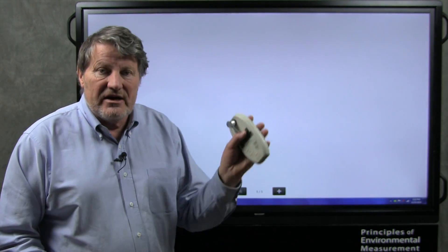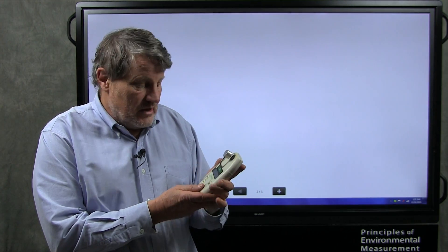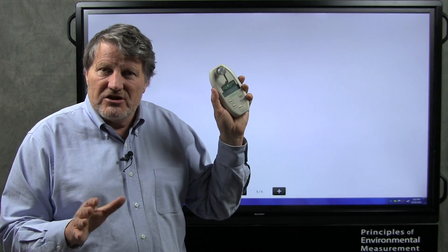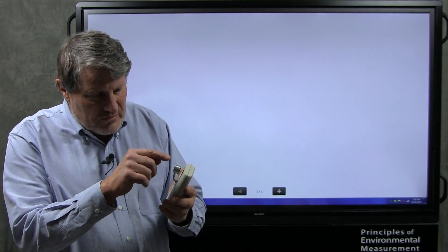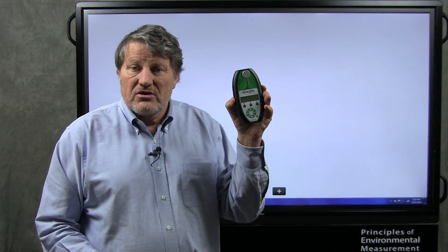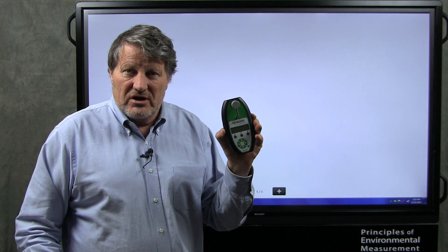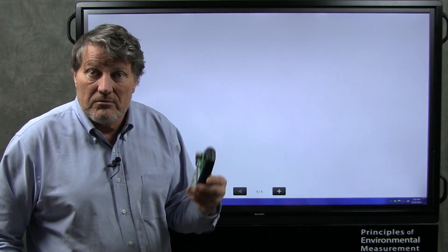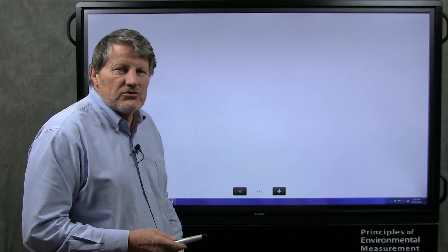Then some years later, OptiSciences came out with this meter. It has some advantages over the Minolta meter, little bigger area to average leaves, and then recently Apogee Instruments came out with this meter, which has some fundamental advances over the other types of research-grade meters for chlorophyll. So let's take a look at what those differences are.